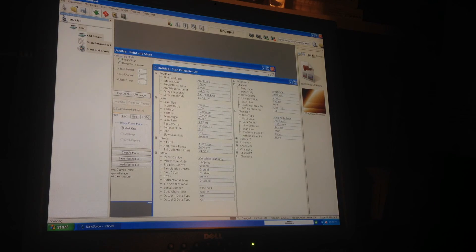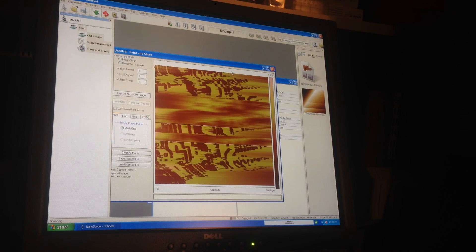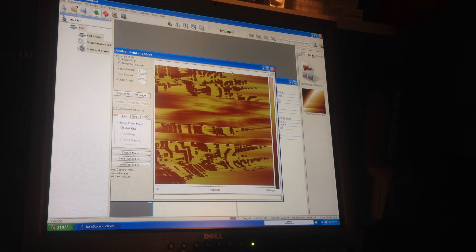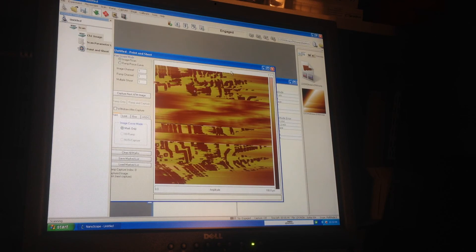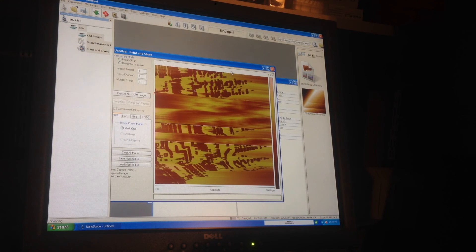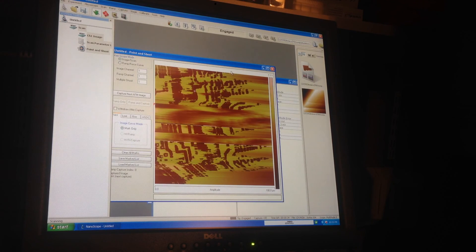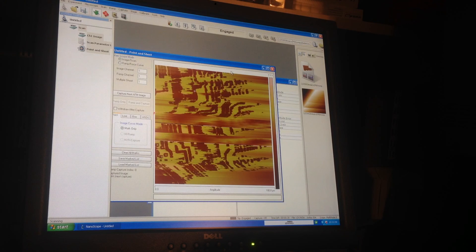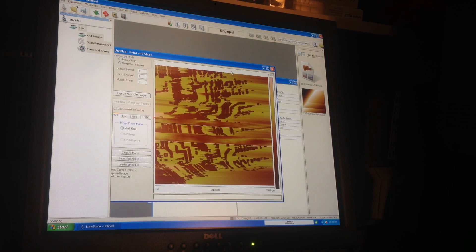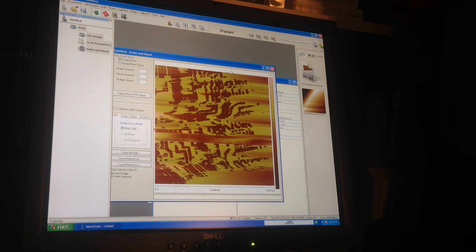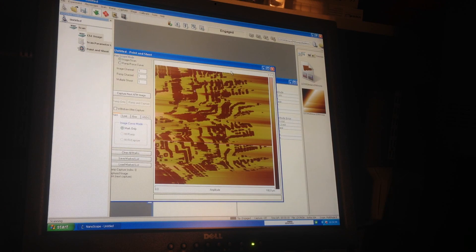Maybe if I change something, you know, maybe something else I can change, but you know, yeah, I'm not an expert. This is the first image I've taken, but this video is partly a log so I know what I did and when I come back to it I can watch this and think okay, that's what I did to get some kind of image out of it. But I'm kind of comfortable I verified the operation of the AFM. This is a functional system, and yeah, I need to think about where to go from here. That's that for this part of the video on the AFM.